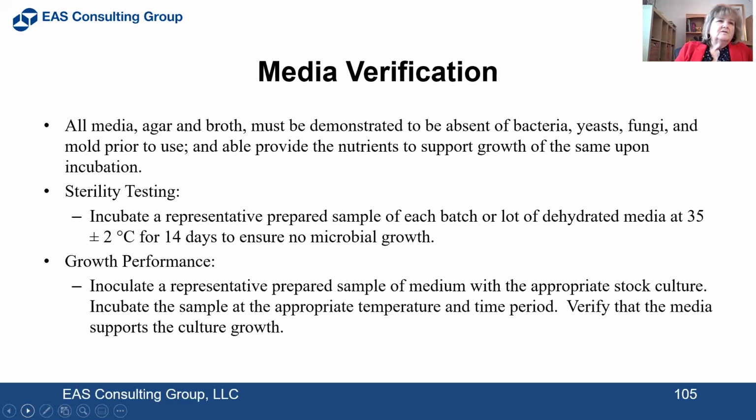And you also could do growth performance. You inoculate a representative prepared sample of medium with the appropriate stock culture. Incubate the sample at the appropriate temperature and time period and verify that the media supports the growth of the culture.